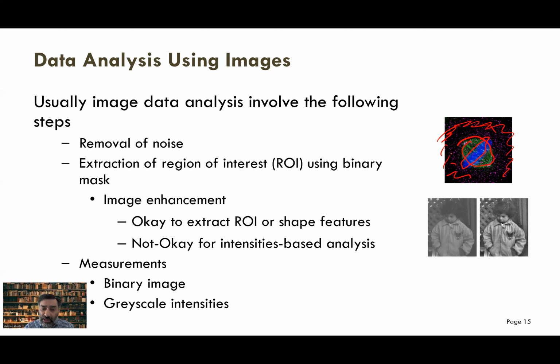If we're doing the image enhancement, now this is a very important point to remember. Look at this image from here to here. This image is being improved and enhanced, but this depends on why we want to enhance this image and what sort of quantification we're going to do.